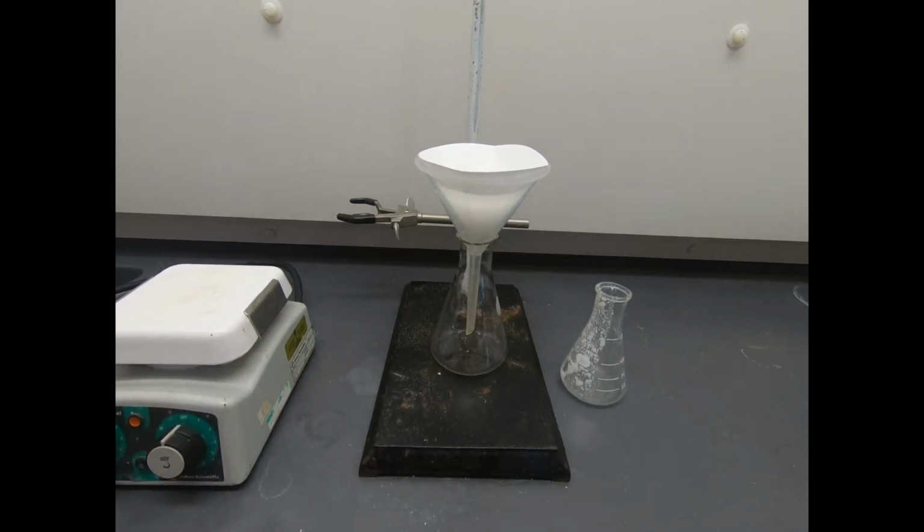When you typically do a gravity filtration, that is a sign that you want to remove the solids and you actually care about the liquids. Normally, suction filtrations are when you want to collect the solid and the liquid might be waste. So in this case, we want the liquid, so we're just doing a gravity filtration through this filter paper. And of course, under certain circumstances, that logic may vary, but in general, gravity filtrations are when you don't care about the solid, but you want to collect the liquid.